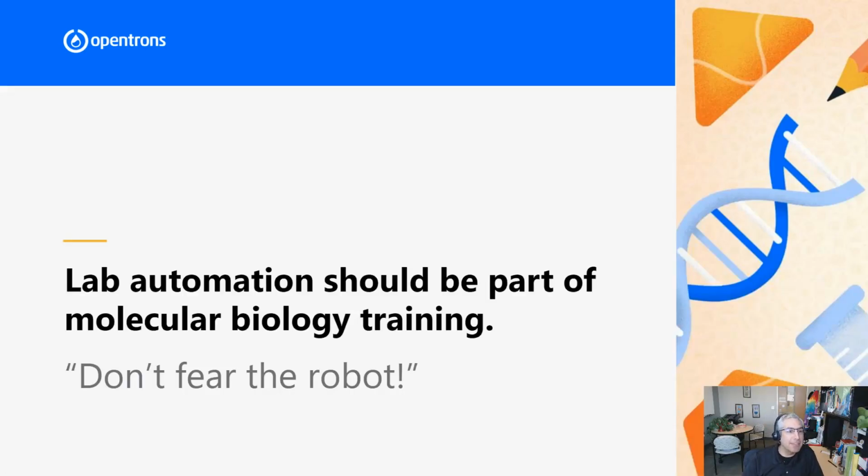So a little bit about this. My catchphrase for several years has been, "Don't fear the robot." That's because I think lab automation should be part of molecular biology training. And to do that, we need both the instruments as well as the awareness of how automation helps high throughput discovery science.